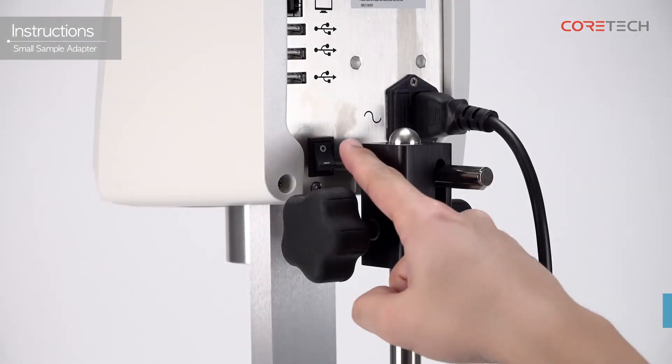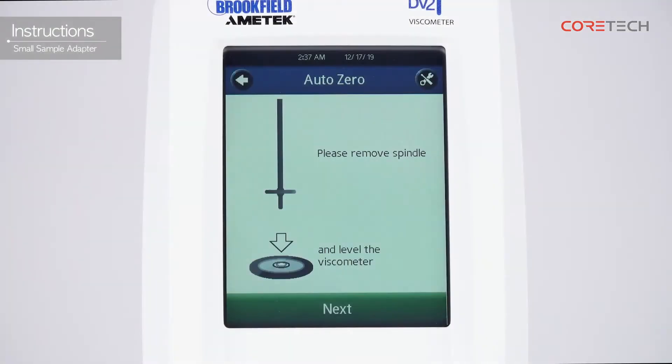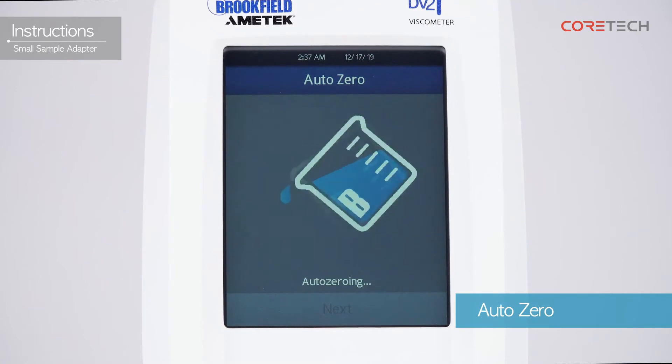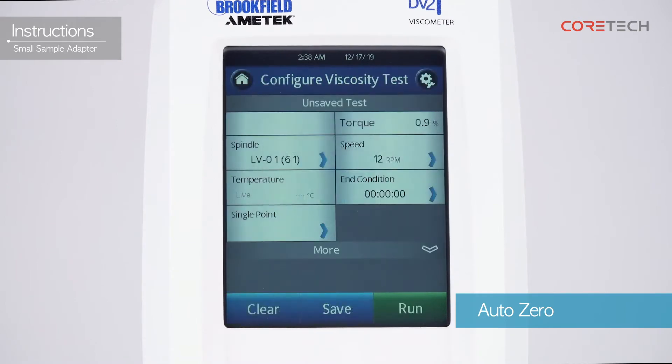Turn on the power using the power switch on the back of the main body. We will now explain using the DV2T viscometer. The screen displays the phrase 'remove spindle and level the viscometer.' Make sure that the spindle is disconnected and the viscometer is level, then touch the Next button. Proceed with AutoZero for a while until the AutoZero completion message is displayed. Touch the Next button again to go to the measurement waiting screen.